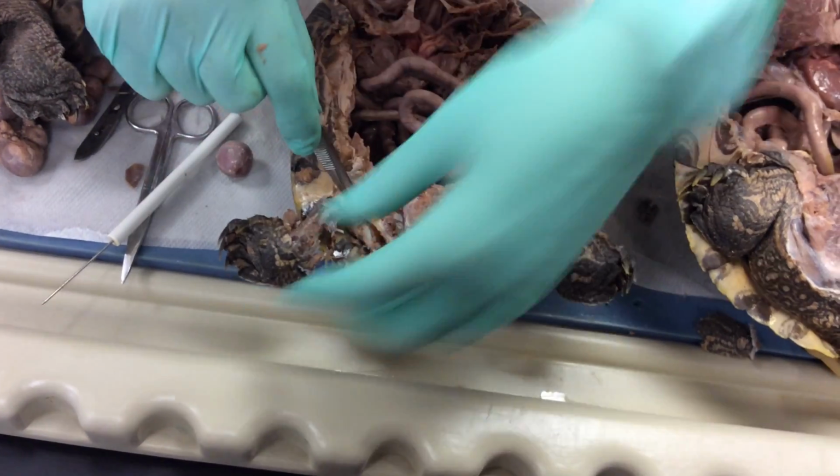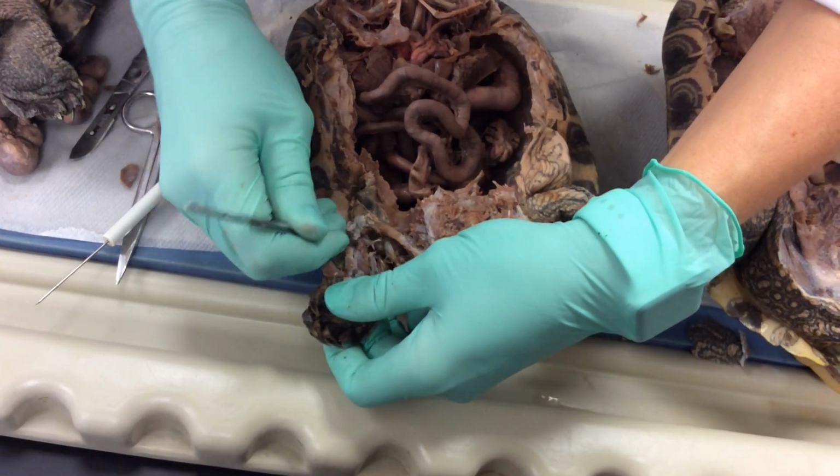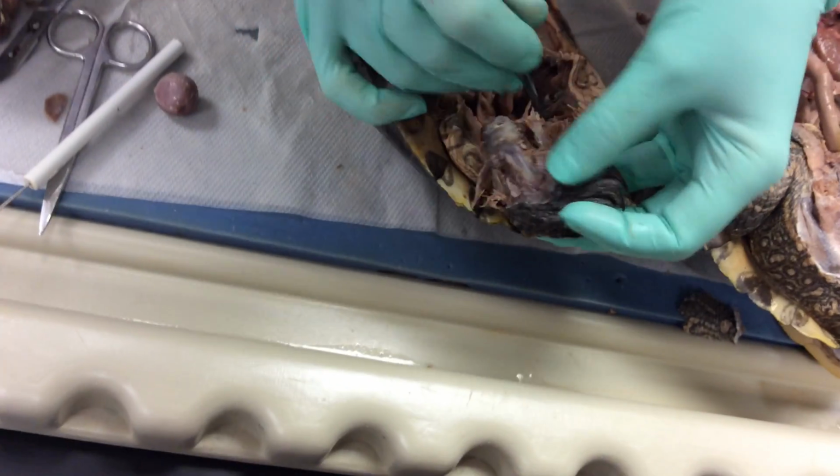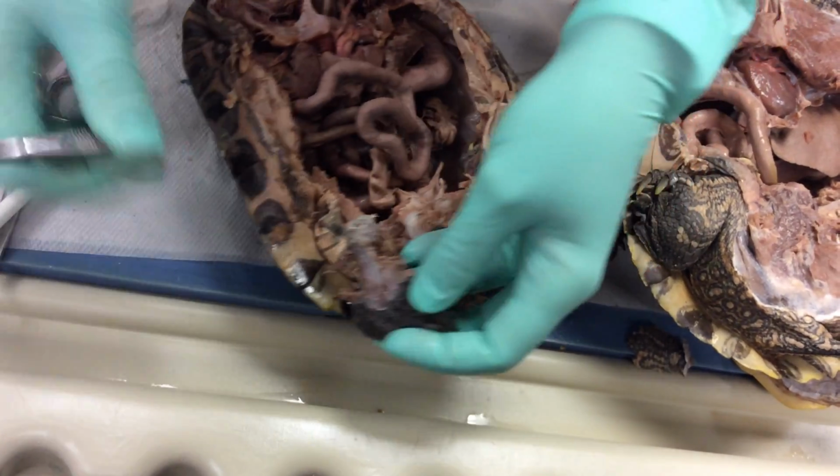This is the femur. And then down here, we're going to look at two bones called the tibia and the fibula. So the tibia is going to be the large bone that's going to be located here, and the fibula is going to be located right back here. And this is the dissection of the turtle.